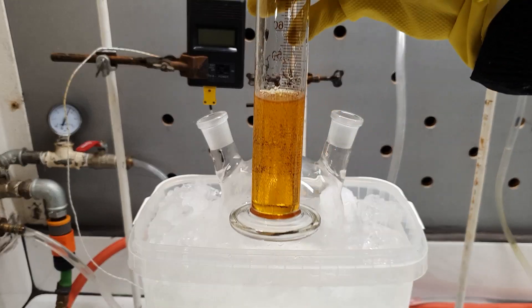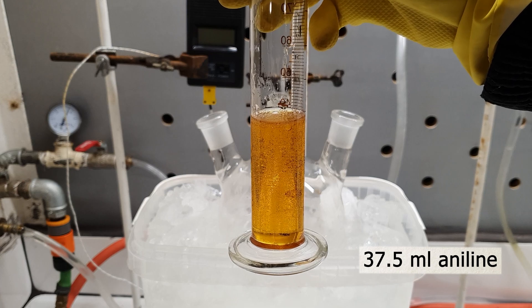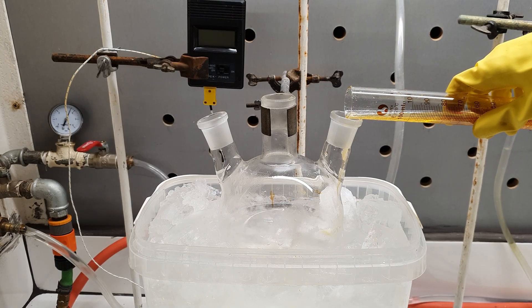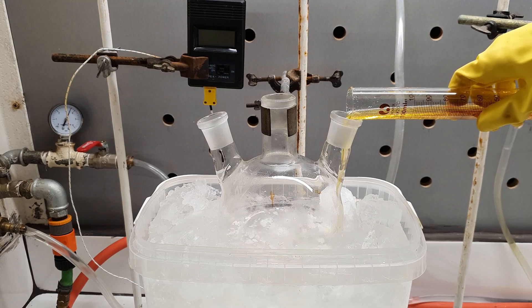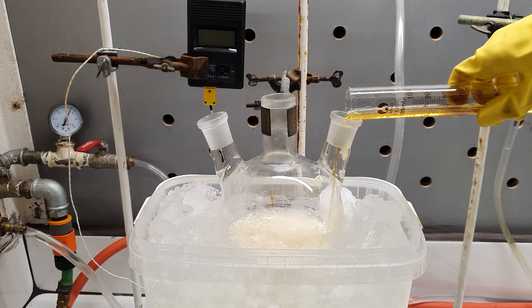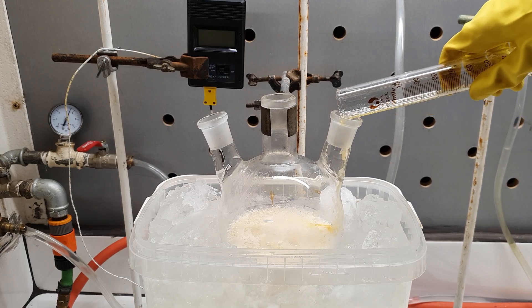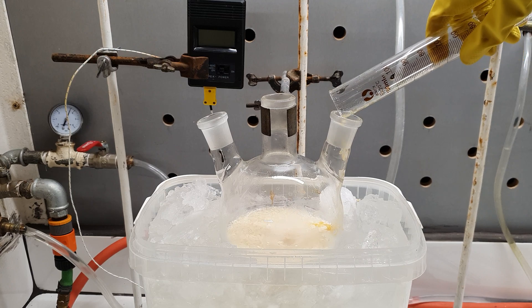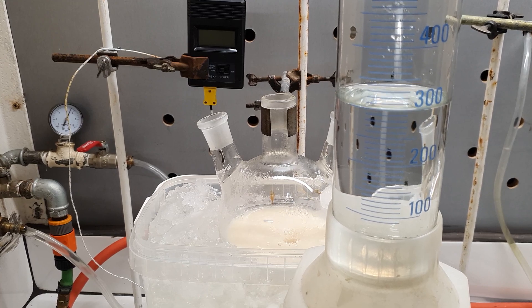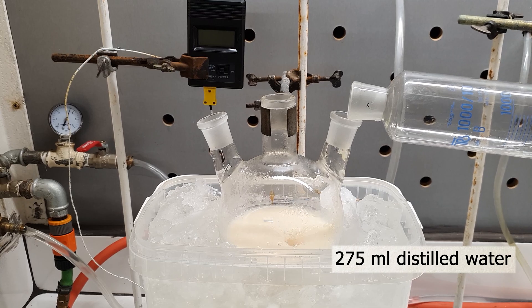Now it's time to add the main reagent, which is 37.5 milliliters of Aniline. The moment it was added, it instantly turned into the sulfate salt, which precipitated out of the solution. To dilute the solution, I added 275 more milliliters of distilled water.